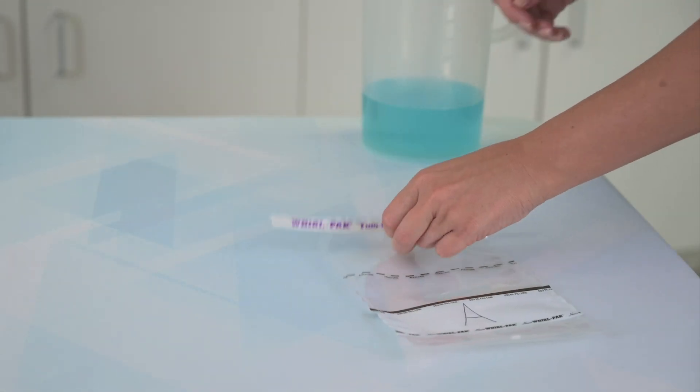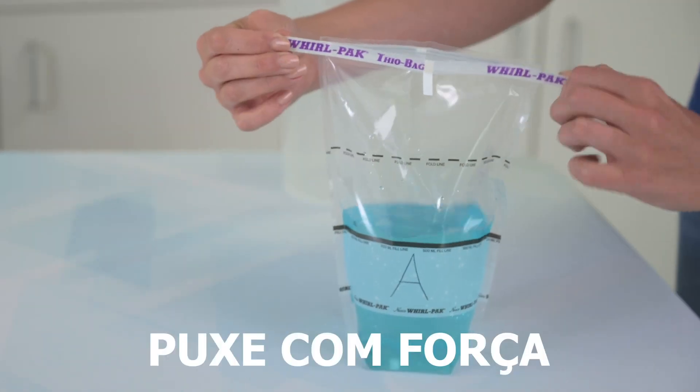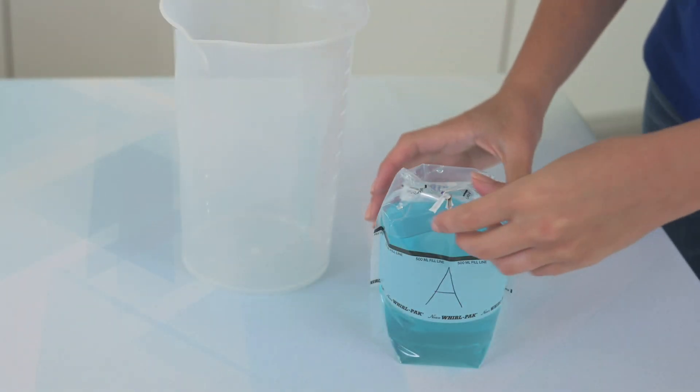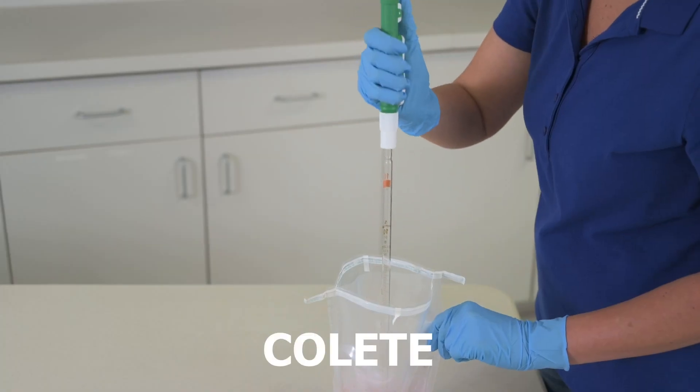With all of our closure bags, for a leak-proof closure, simply open, fill, pull tight, whirl or fold, fold in tabs, and twist. And to open, it's just as easy: untwist, open, and collect your sample.